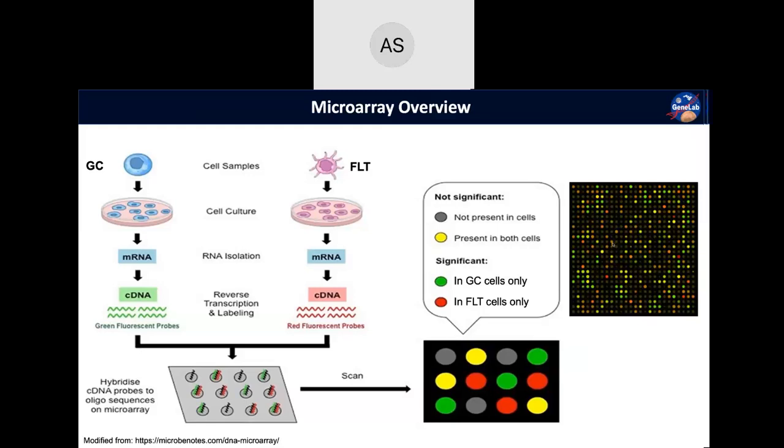And then those fluorophores are measured, right? So we can quantitate the expression of light at these different wavelengths to get a relative expression of the genes in each sample. Any other questions about microarrays before I start talking about limitations? Okay, good questions so far, guys.